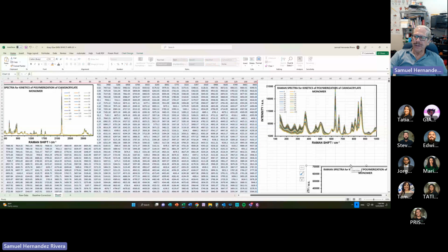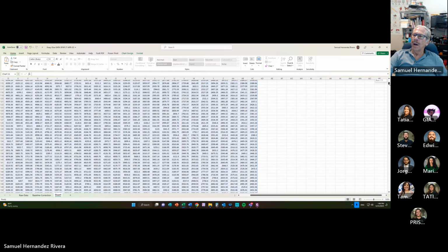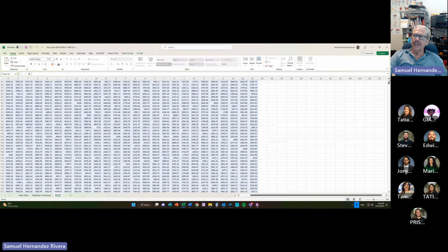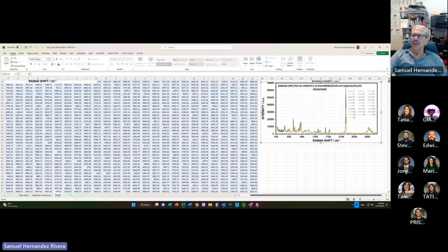There's my third spectrum. Okay, now let's zoom in the 2000 to 3200 wave number region.